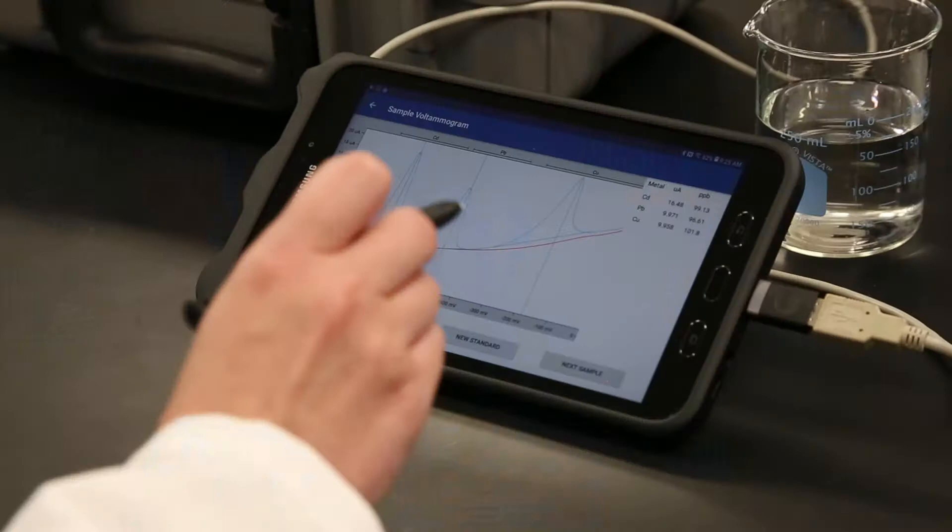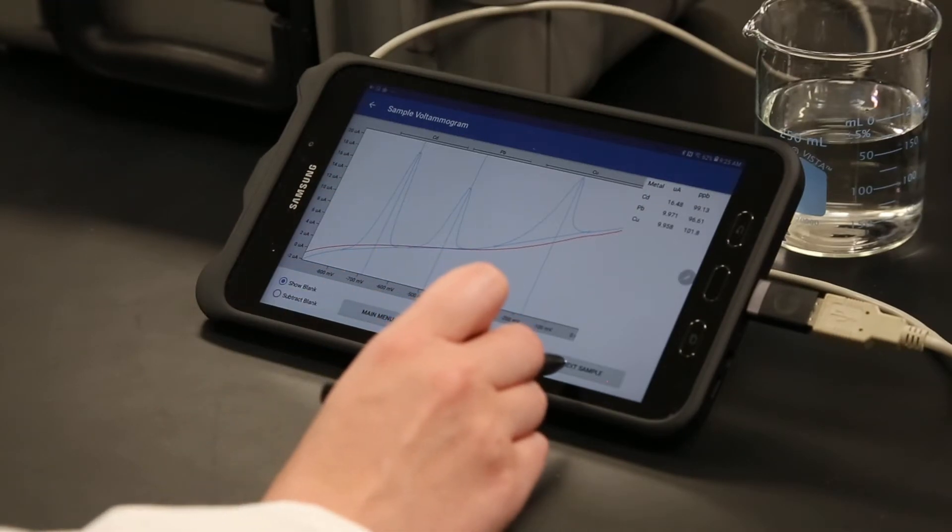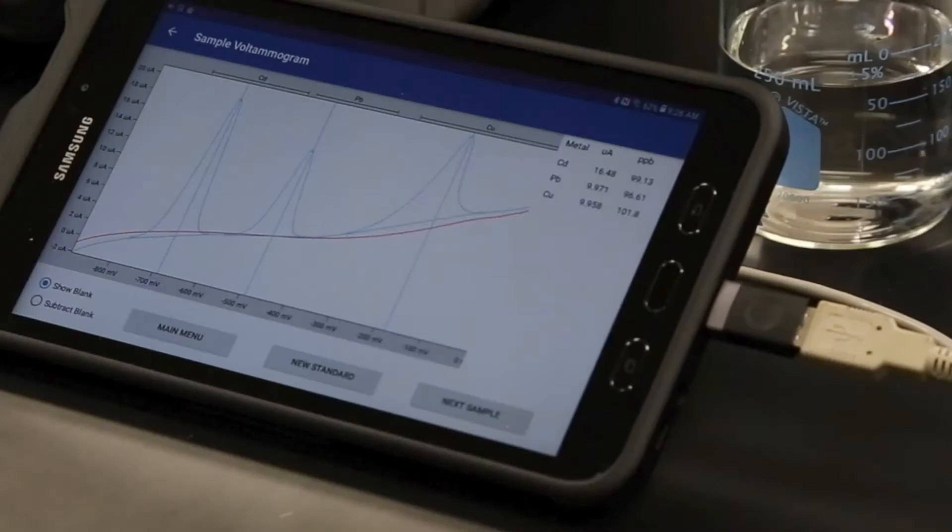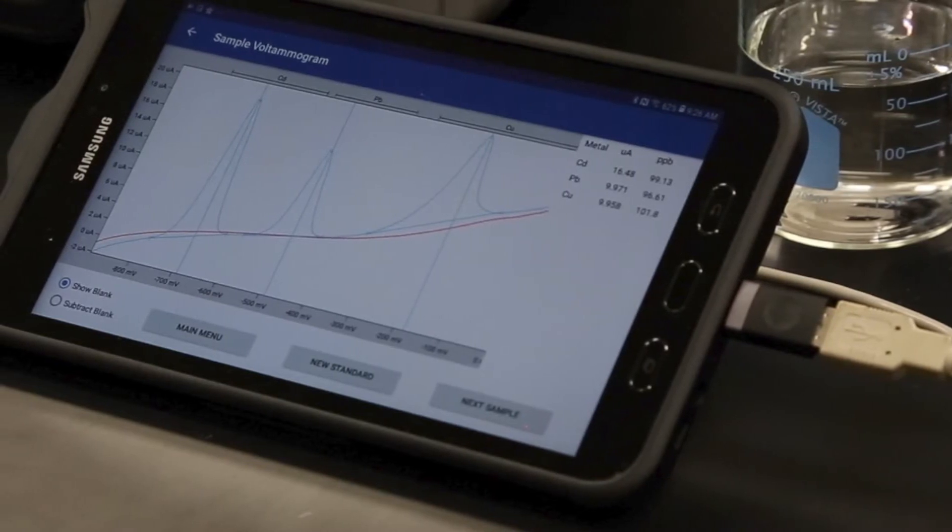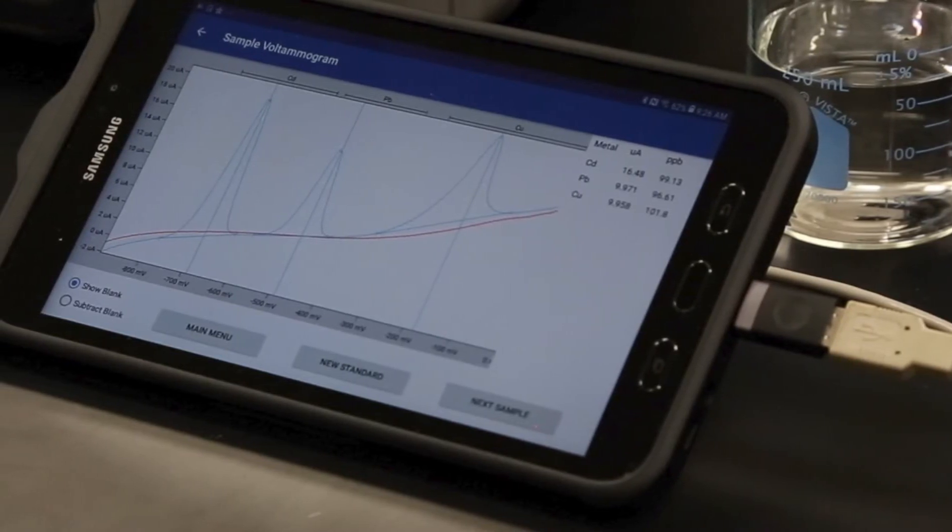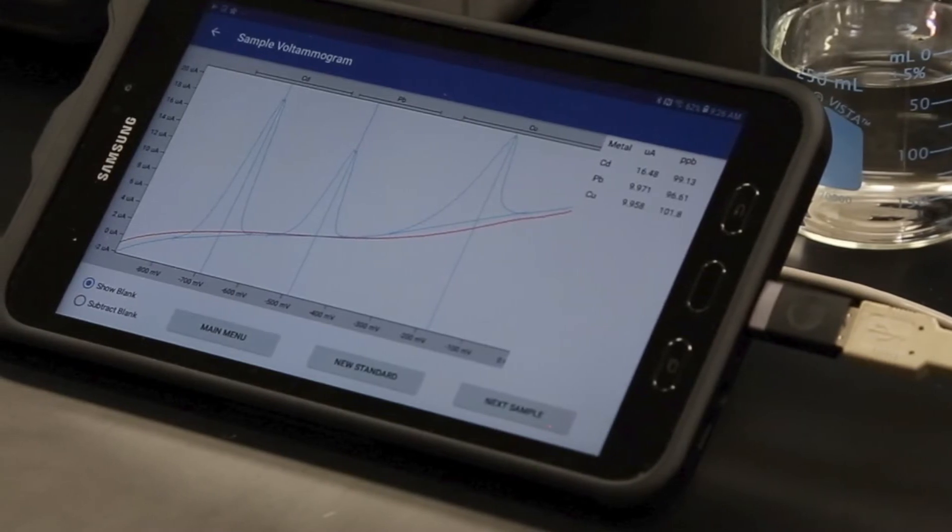There are now three options. Analyze another sample using the same calibration standard with the Next Sample button. This will return the user to the start of this section. Up to five samples are typically recommended for a single standard, although the software will allow more.